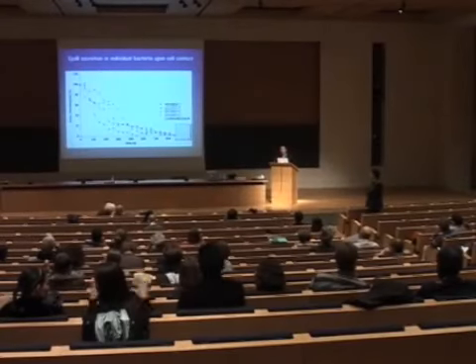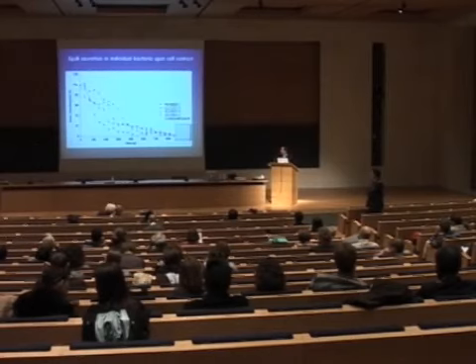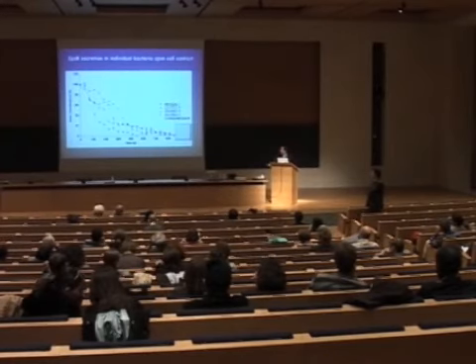And I just pulled down the same type 3 secretion real-time imaging that Jost performed, because we observed at the time that once in a while you can see that in some bacteria you had secretion starting and then stalling and resuming again. That's interesting because that suggests that there might be discrete events in type 3 secretion. One way to interpret that would be that perhaps there's only one single apparatus that is active at a time, and when it switches off, then secretion stalls. This is one possibility, or perhaps a discrete number of apparatus.